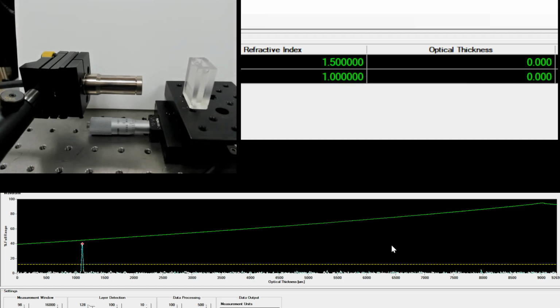Yep, I think I did it. All right, stop. Oh, wait, it's coming up. Maybe. Oh, look at it. It's going to pop up. As those undissolved salt crystals settle out and the fluid gets clear, we can see that we're starting to. There we go.